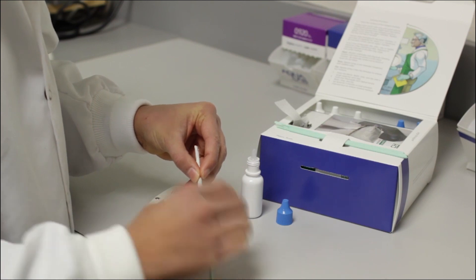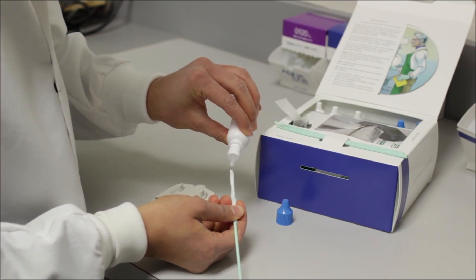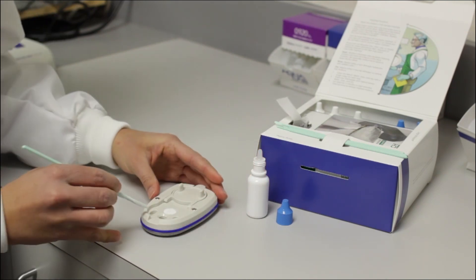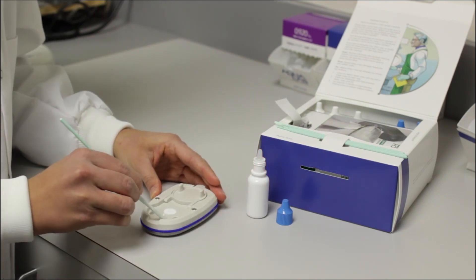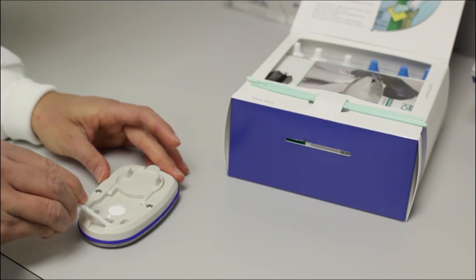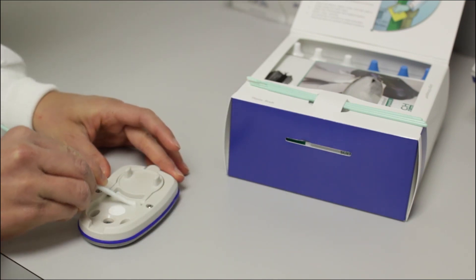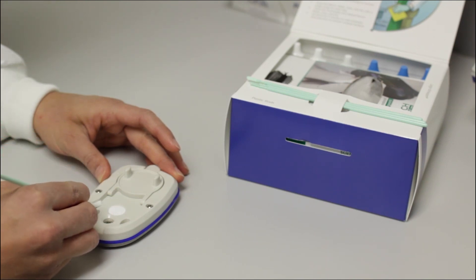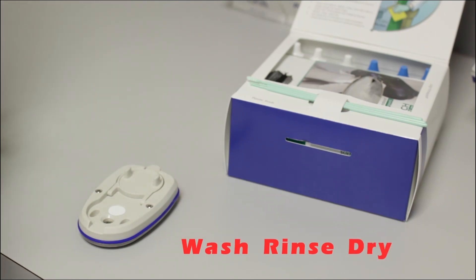After washing the surface of the chamber, moisten a kim wipe with distilled water from a bottle in the cleaning kit with a blue lid and rinse all surfaces. Remember to avoid the filter. Then with a dry kim wipe, dry the surface of the chamber and make sure no residual moisture remains. The most important things to remember during the cleaning process is to wash, rinse, and dry your instrument.